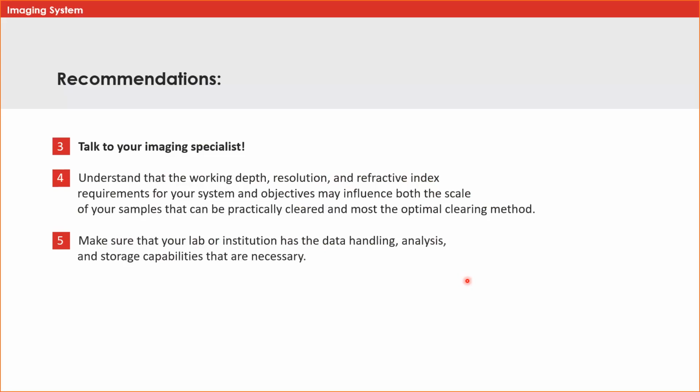Given the size of a whole mouse liver, imaging an intact liver with a confocal would not be practical due to the scan time and depth limitations. This doesn't mean that you cannot obtain significant and informative images or even build an entire 3D construct of the liver. It does mean that you will need to plan your approach, either use smaller sections or reduce the total volume of tissue that you will be imaging. While I don't want to give away too much, we have some recommendations with sample volumes down the road.